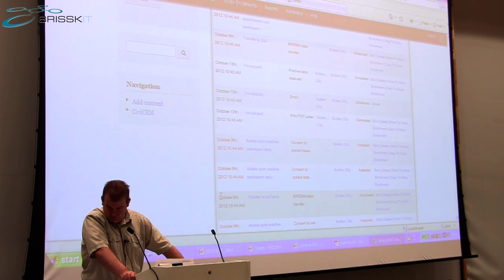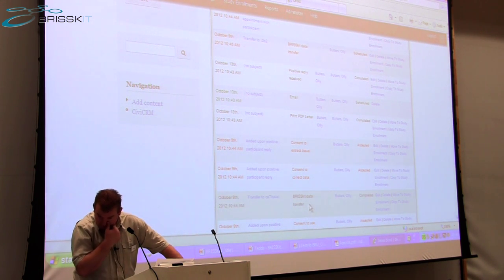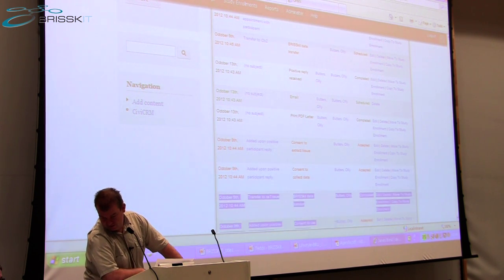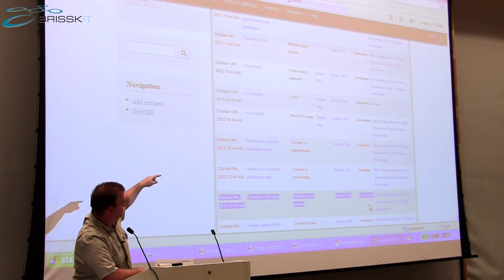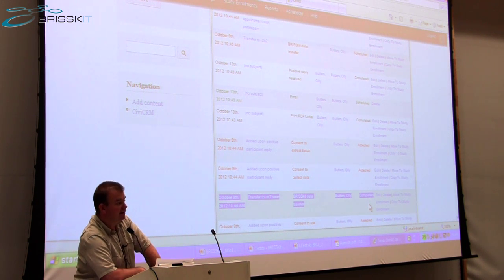Okay, so what Olly was just highlighting there, or can you do that again? So having marked consent to extract tissue two lines above the one that's highlighted as being accepted, that created a scheduled activity for transferring data to CA tissue.